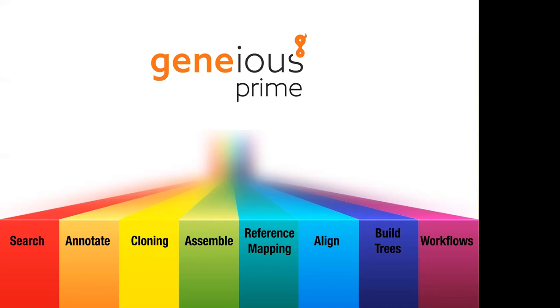You can do classical restriction cloning. You can do Golden Gate cloning, which is really just restriction cloning with type 2S enzymes. You can do Gibson assembly. And just be aware, when we talk about Gibson assembly in Geneious, that particular tool also does things like In-Fusion cloning and CPEC cloning, some of those homology-based cloning methods. You can also do Gateway cloning, TOPO cloning. You can also find and evaluate CRISPR sites. So lots of different cloning methods.